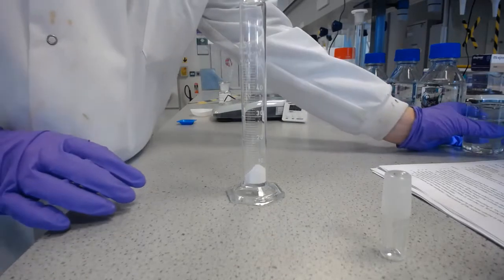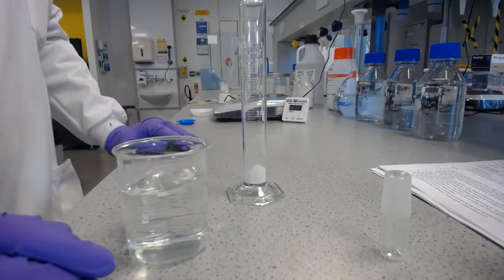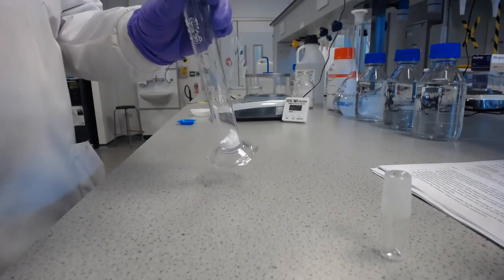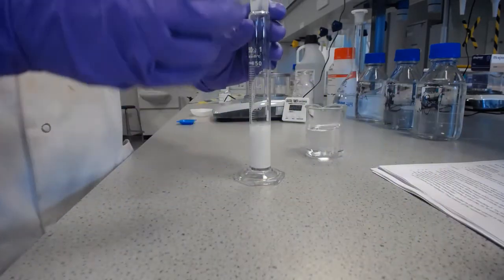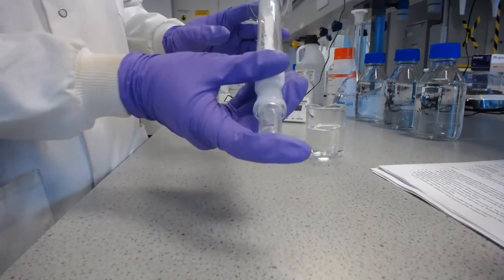I'm going to do this one with just the water. And so it says put around 15 millilitres in. Now we don't need to be accurate with this first part because we're just making an admixture. So that means a more concentrated mixture at the beginning. I put in 20 millilitres there, maybe a little too much, but we don't need to be accurate at this point. And then we're going to put the stopper in the top.